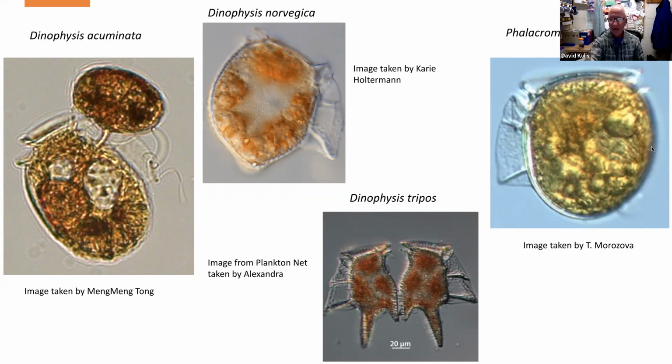You can see that it's much broader in appearance, more squat, much more broad than Dinophysis acuminata. So anyways, bear that in mind. You might want to consult a guide like Identifying Marine Phytoplankton by Tomas. If you can get a copy of this, it's a wonderful resource, and I highly recommend having that at your disposal when you're checking out samples.